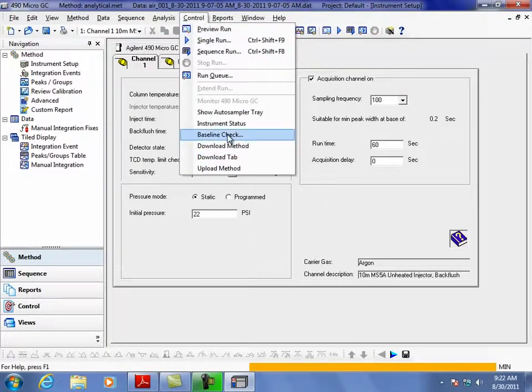What is it doing right now inside? It's making noise. That's the solenoids that are going through their diagnostic clicks. It goes through a check of each one of the solenoids on all of the pneumatics. It also goes through a flushing state where it's opening them up and flushing all the gas out, which is good considering we've got the wrong gas going into it. There may be a few things that we see in the software or in the chromatogram right now that won't look normal. I won't know until I run it. But we'll take a look at it and see.